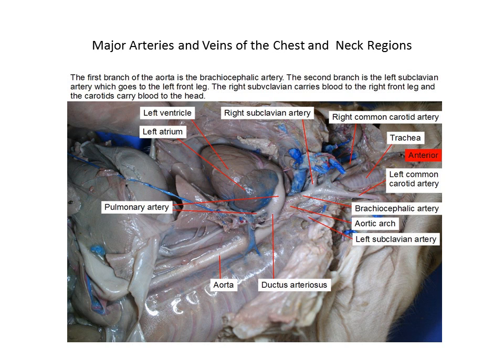So today we're going to do some of our heavier butchering of our pigs, okay? Notice that you have access again to the backside, but that's where you're going to see these special fetal structures, including the Ductus Arteriosus. Try to identify this before any attempts to cut out the heart, to take a look at that in any greater detail.